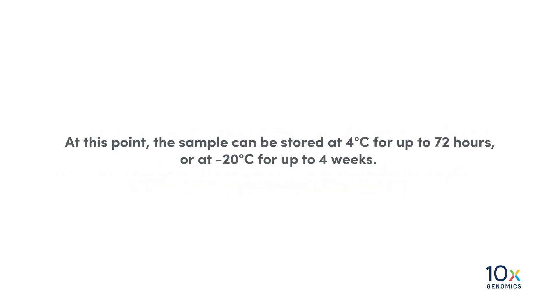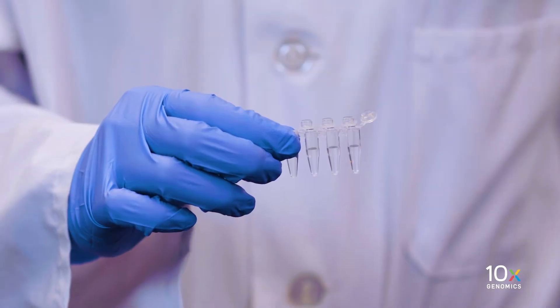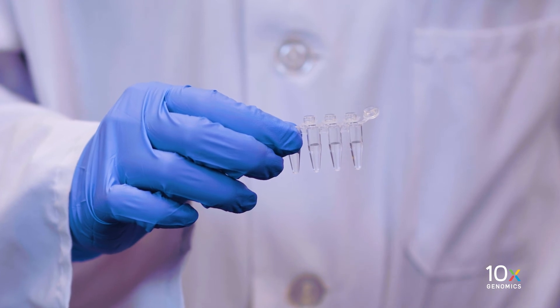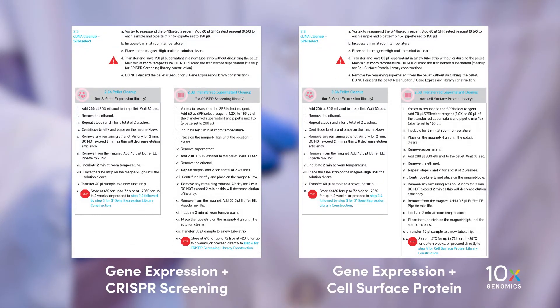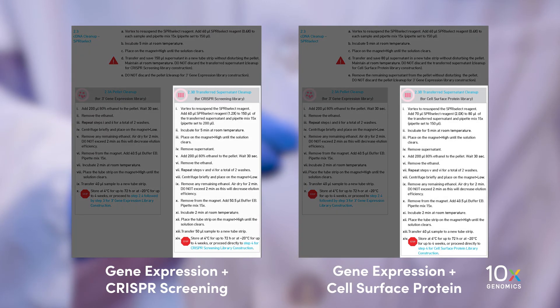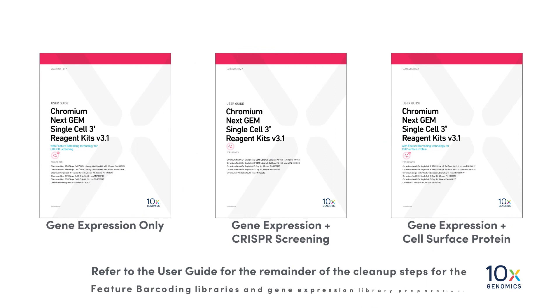At this point, the sample can be stored at 4 degrees Celsius for up to 72 hours, or at minus 20 degrees Celsius for up to 4 weeks. Remember, we have set aside the transferred supernatant for the Feature Barcode Library. The next step for this transferred supernatant is to perform an additional SprySelect and other cleanup steps. We've now completed a SprySelect cleanup for the Gene Expression cDNA. Refer to the User Guide for the remainder of the cleanup steps for the Feature Barcode libraries and Gene Expression library preparation.